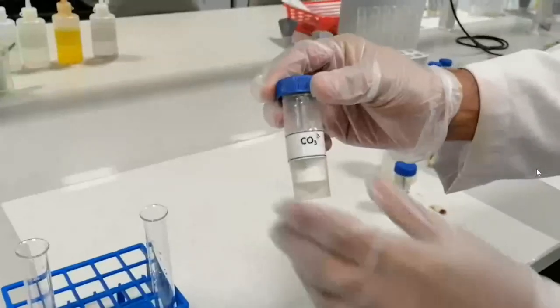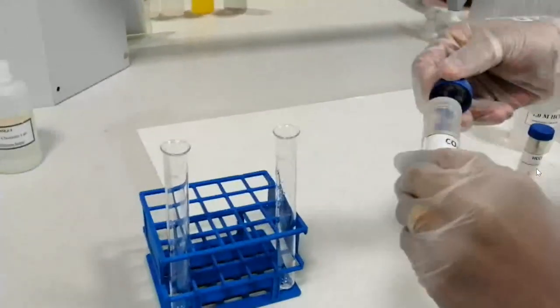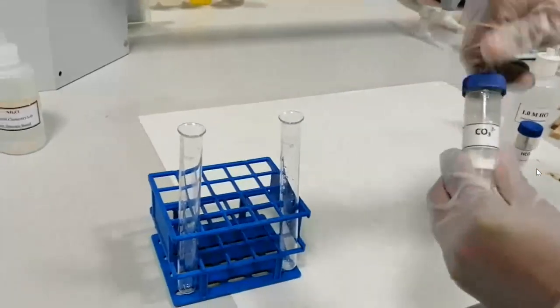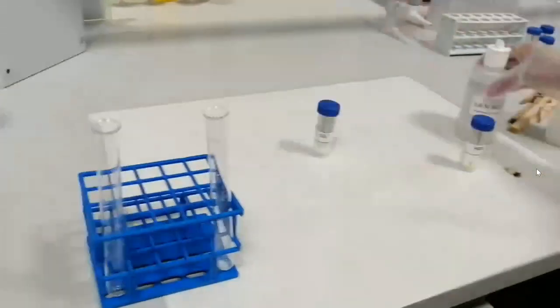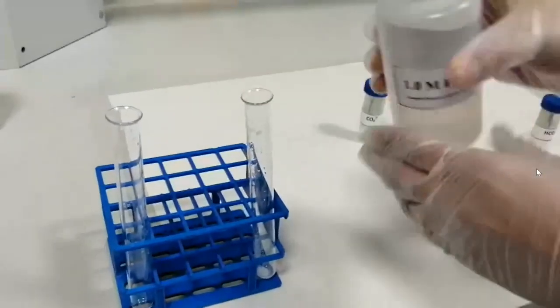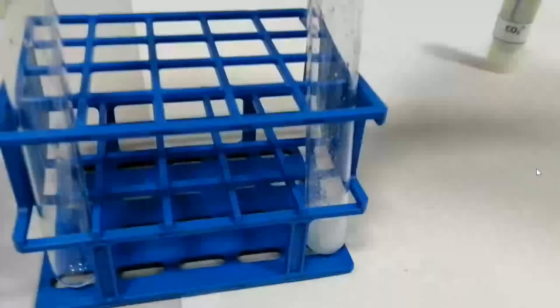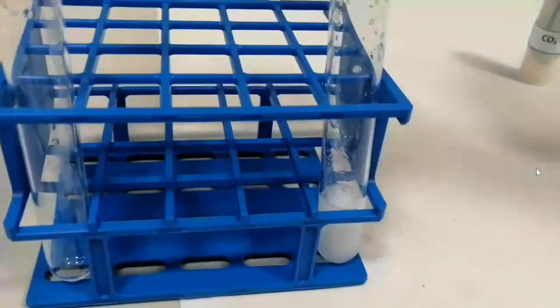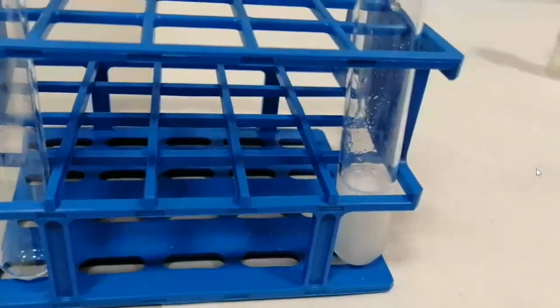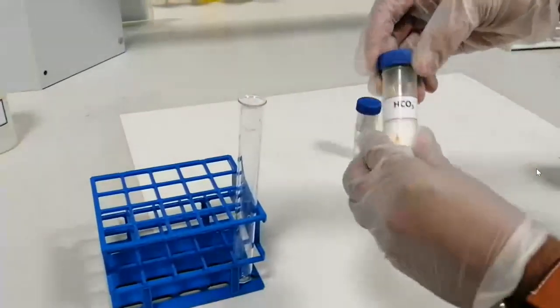We are going to do the primary test, which involves the reaction of the salt. Just add a few crystals in a dry and clean test tube, and then just add dilute HCl. This is the primary test for the first group, the dilute HCl group. What is the observation? Just effervescence, you can see it and you can hear it, and a colorless gas evolves. This gas is carbon dioxide.